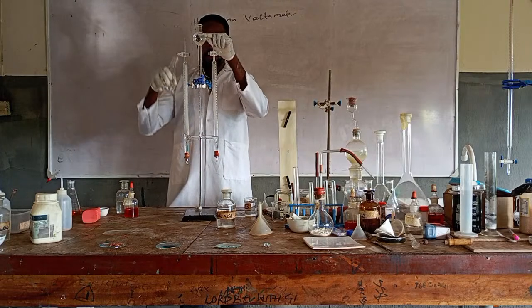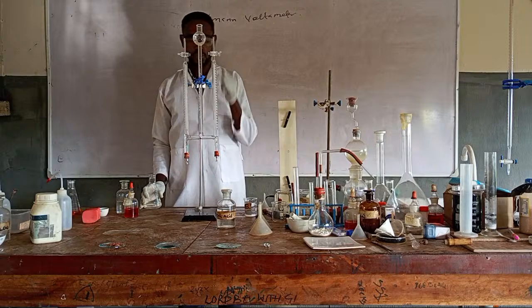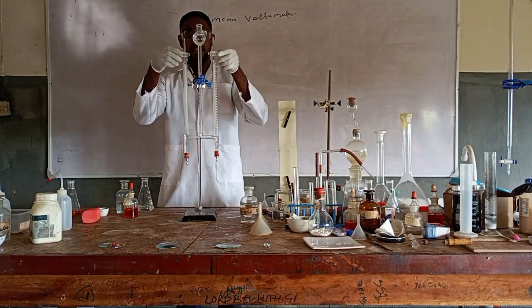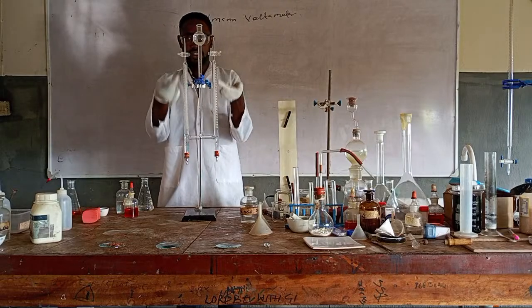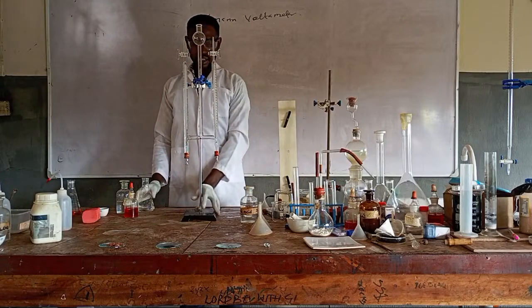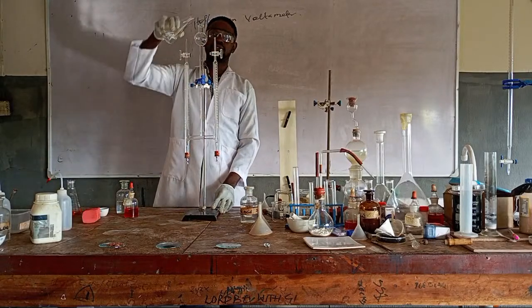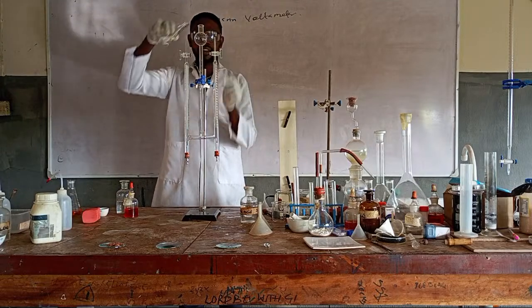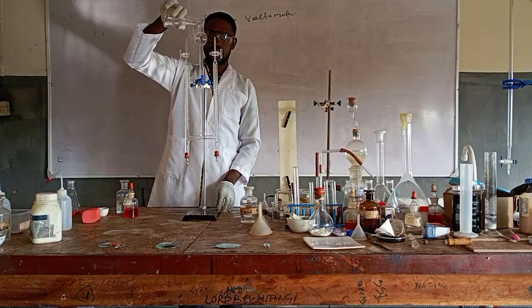See, the reservoir bulb is filled while this is still empty. Why? That's the effect of pressure. If I open here, the water will flow down into this. Are you seeing it? Okay. So I will fill it gradually to the 0 mark before we start.